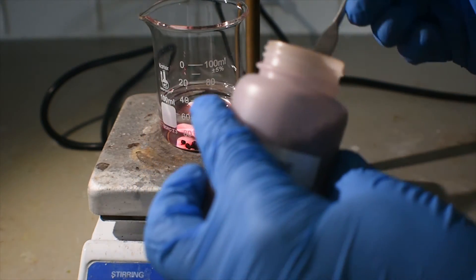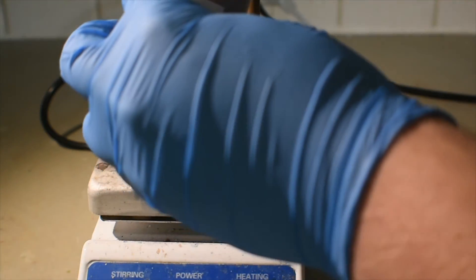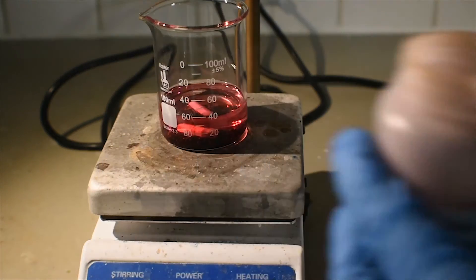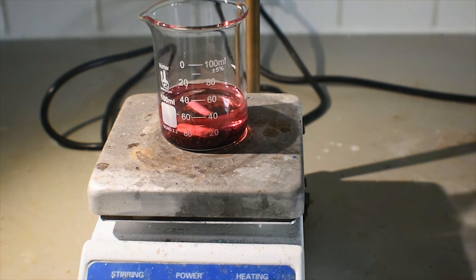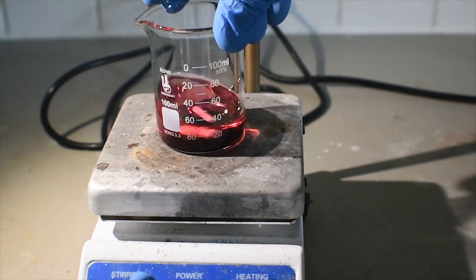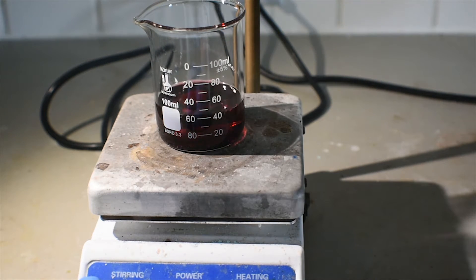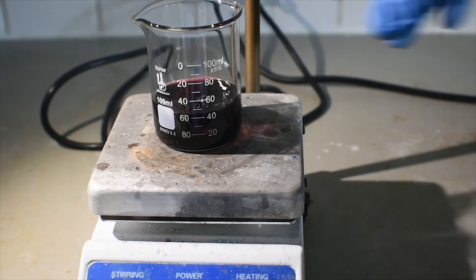Just a few spatula fulls — probably about two and a half. You will be able to see the very nice dark, almost permanganate-colored color of the iodine dissolving in the chloroform. I'm going to turn on stirring and you'll see that solution gets very dark purple-red. That is exactly what we want.